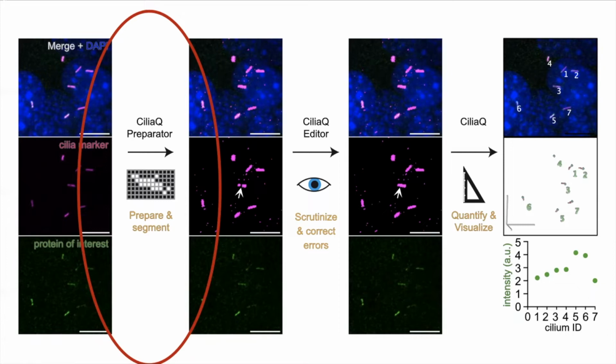So your image of interest can be TIFF files or a raw microscopy file. And CiliaQ Preparator opens these raw microscopy files by using the plugin named Bioformat, which is pre-installed in Fiji.